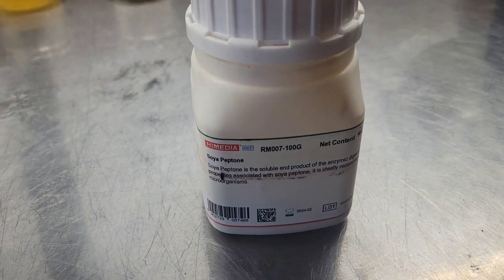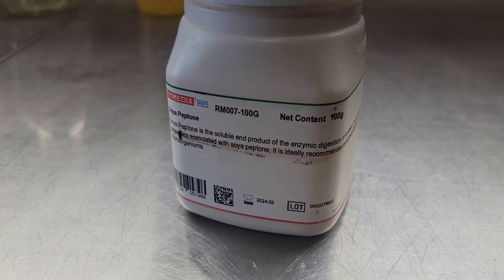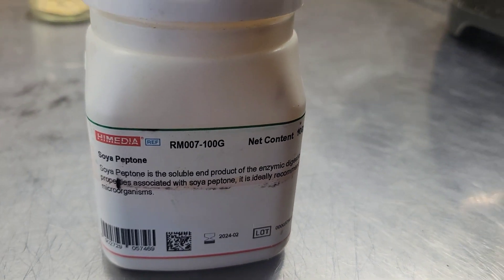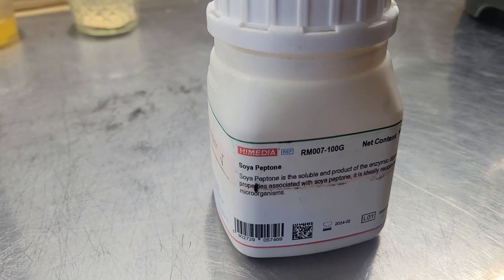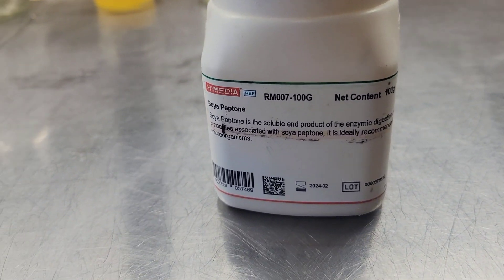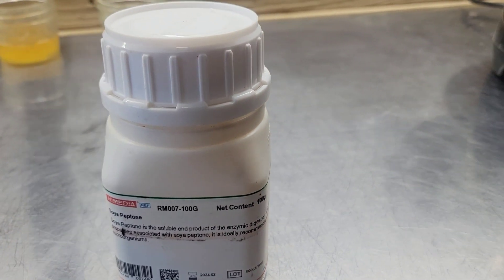We're making this liquid culture recipe today in honor of Terence McKenna's birthday, and you guys can try this recipe out yourselves to grow some mushrooms. The soya peptone is the secret ingredient — it increases nitrogen and really makes that mycelium blast off. We are only going to be adding one to two grams per 1000 milliliters of water in this LC recipe.